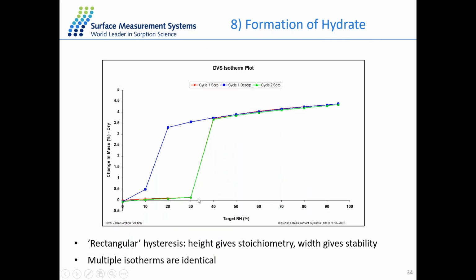If we also have the molecular weight of the sample we measured, we can calculate the stoichiometry of the water, like how much water is absorbed in forming the hydrate, whether it's a monohydrate or trihydrate, from this kind of isotherm calculation.